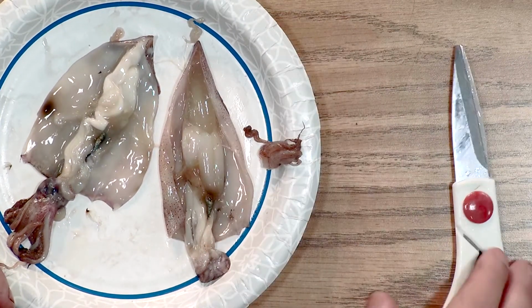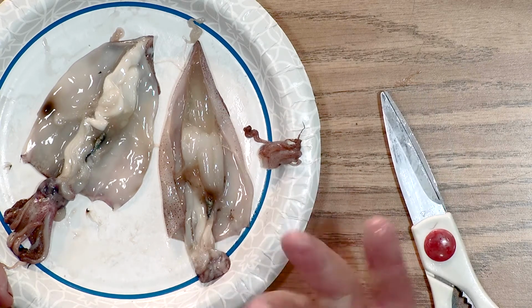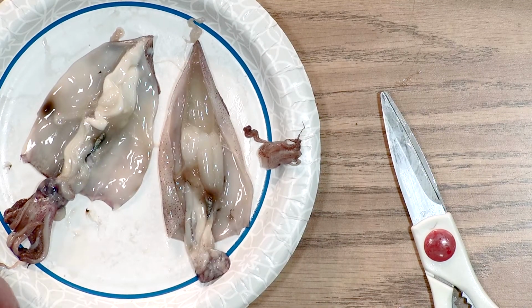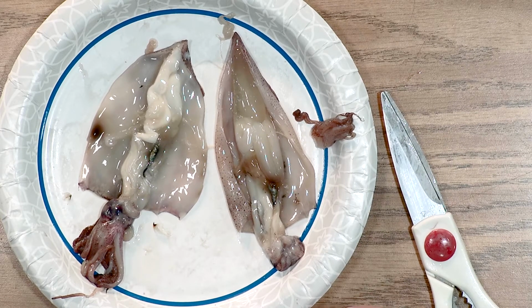So here you've got, on one side, down here at the tip, a very clear, kind of murky area, and then this is way more milky on this side. Totally different. All right, so we've got this great side-by-side comparison of a male and female squid. Which one do you think is which?